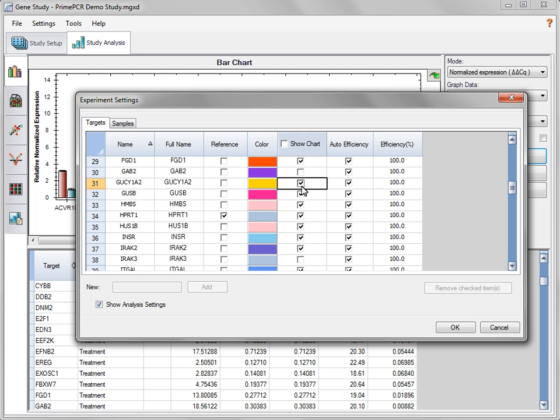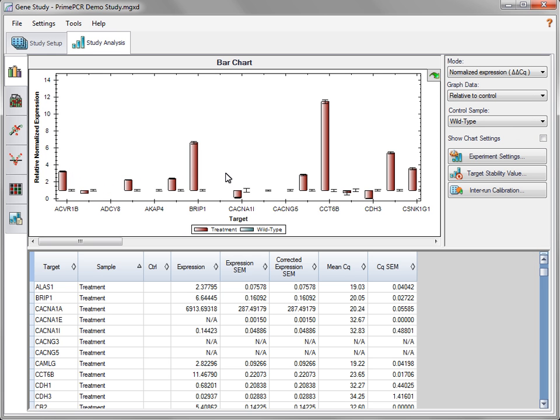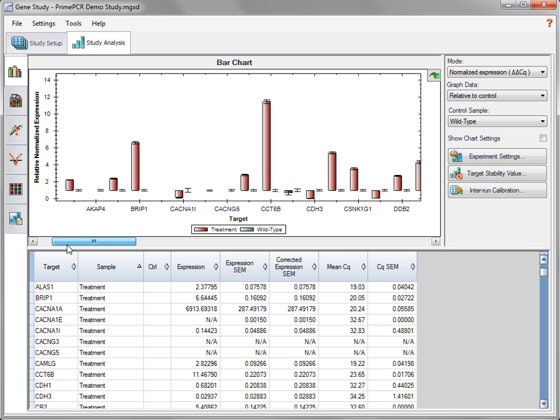Exclude targets from the display by deselecting them from the Show Chart column. Select the control sample by choosing it from the Control column of the Samples tab. If all of the bars do not fit in the Bar Chart window, use the scroll bar to scan through your data. The control bar can also be used if there are more targets than will fit in the spreadsheet pane.